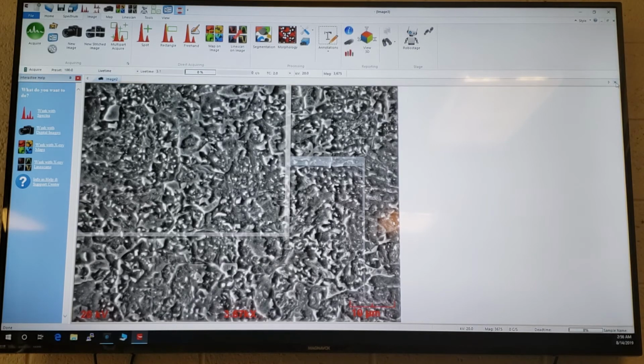So if the software window opens as such, where's the histogram?